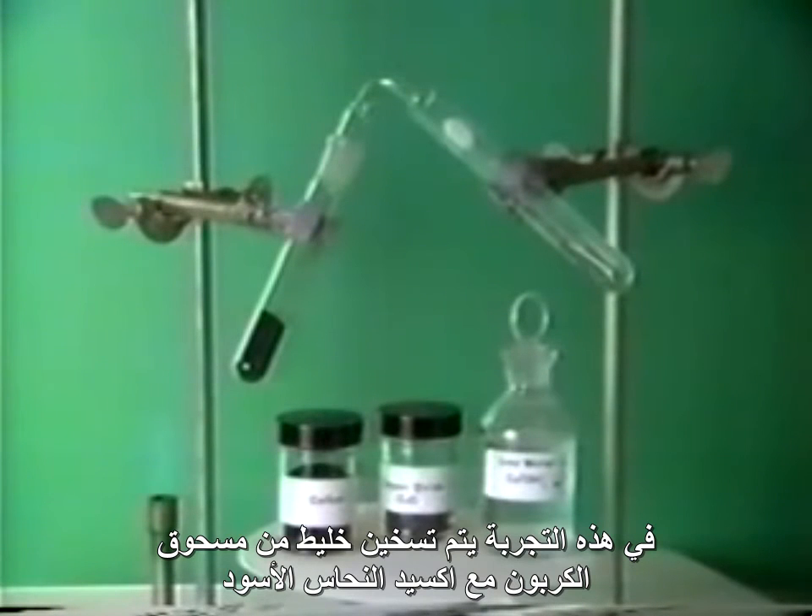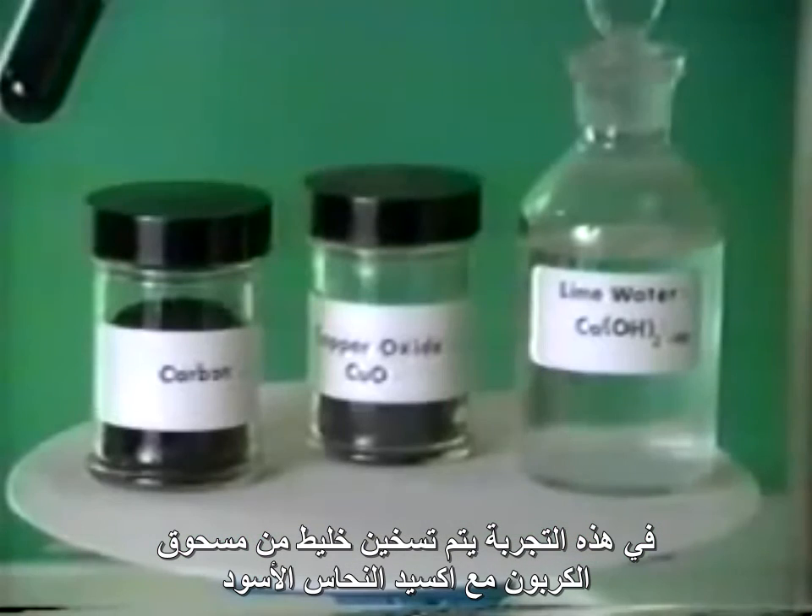In this experiment, we heat together a mixture of black carbon powder and black copper oxide.